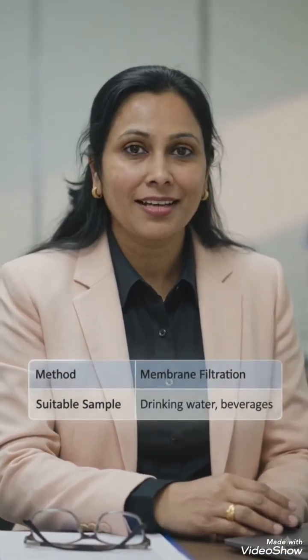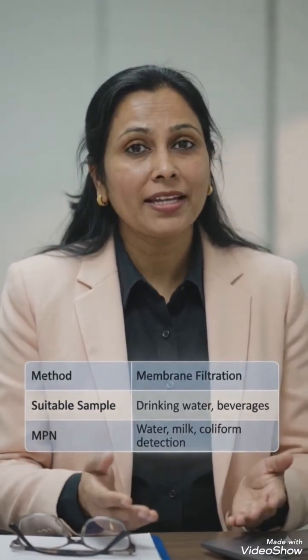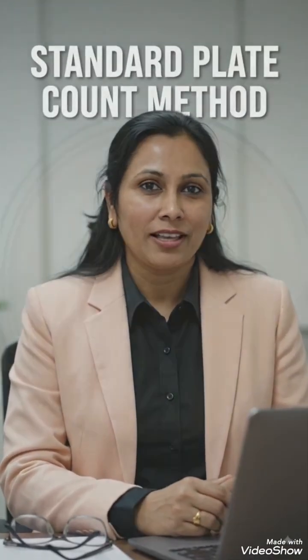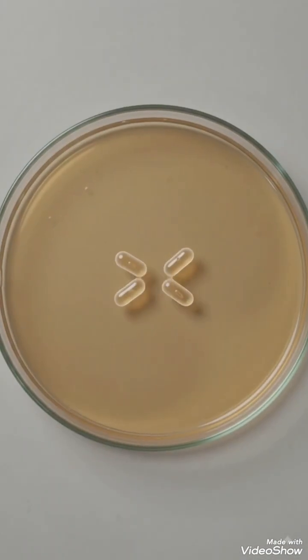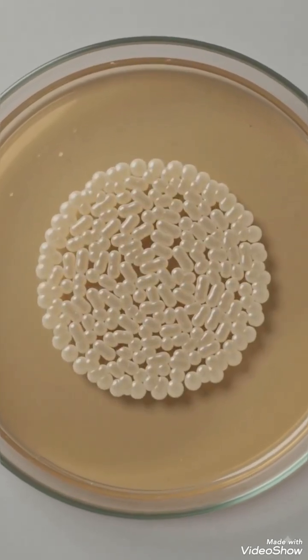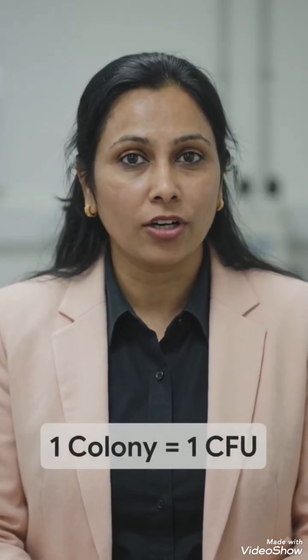We use standard plate counts for food and milk. Membrane filtration is ideal for beverages, while MPN is best for water. The standard plate count method is based on a simple principle. Every viable microorganism, when provided with suitable nutrients and incubation conditions, grows into one visible colony. Each colony develops from one microbial cell or a group of cells and is known as a colony-forming unit. We can estimate the number of viable microorganisms in the original sample.